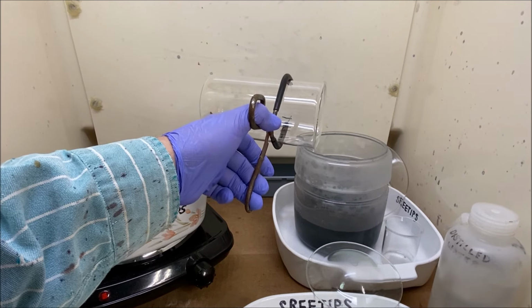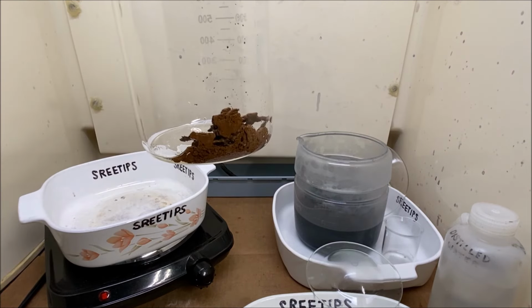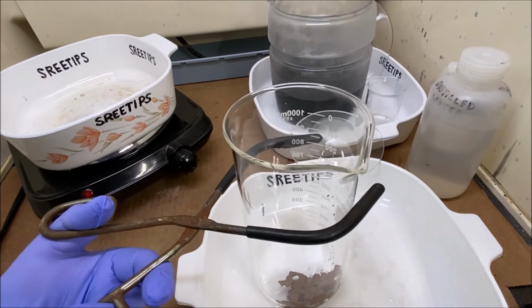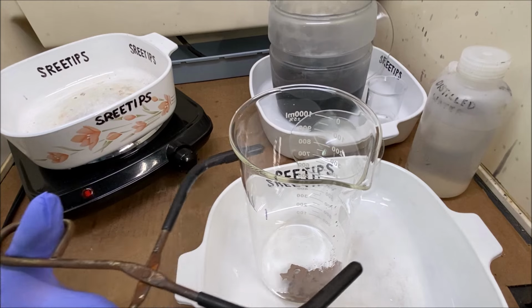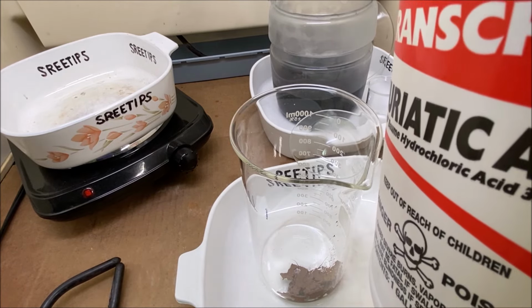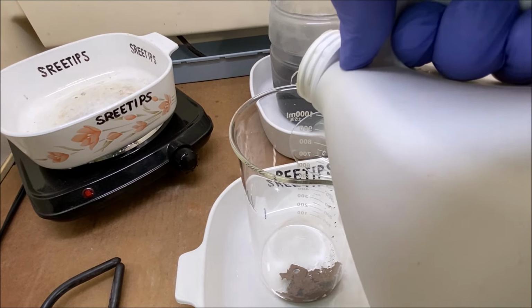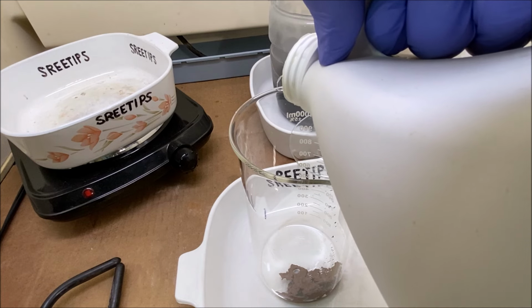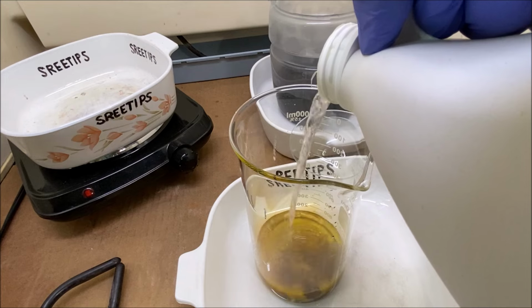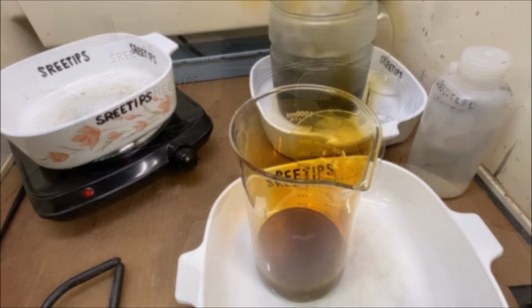So now what we'll do, here's our gold down in the bottom of the beaker. We'll dissolve this in some aqua regia. I'm adding hydrochloric acid. This is about just under an ounce of gold, so we're going to go with about 150 milliliters of hydrochloric acid.